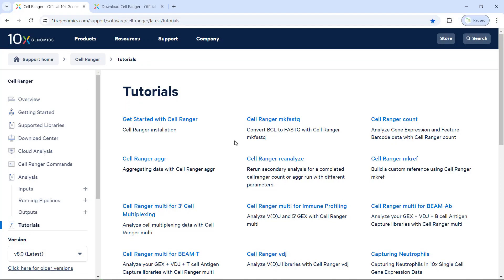Hello everyone. Welcome to my video tutorial for single cell RNA sequencing data analysis. In this video, I'm going to show you how to download and install CellRanger on a high-performance computer.